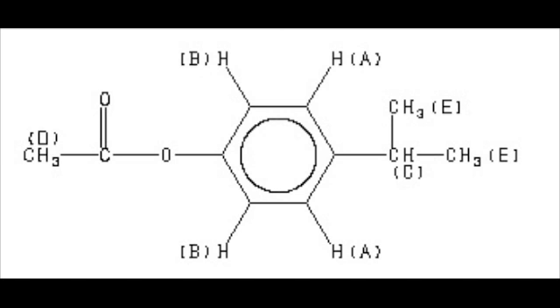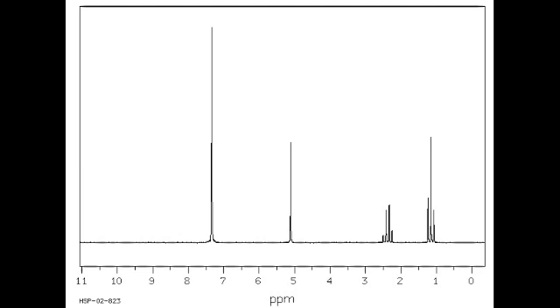Anytime you see an isopropyl group like C and E form, you're going to see a multiplet, more particularly 7 distinct peaks forming one multiplet, and then a doublet. And you see 2 carbons, they're both marked E, right? So you think you're going to see 2 doublets. Wrong. You're only going to see 1 doublet. And the reason why is both those carbons with hydrogens marked E are identical in terms of the nuclear spin properties and the resonance fields that they have.